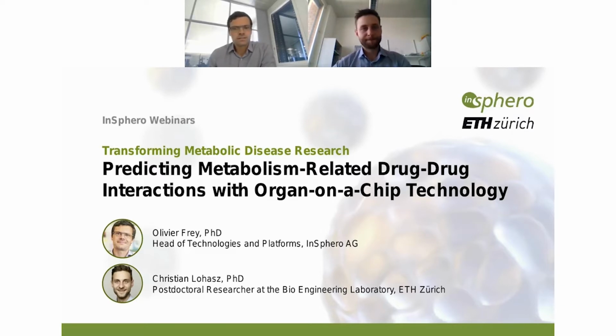So the presentation that we will give is the fruit of one of the collaborative efforts that InSphero had with ETH in the past, where we developed a microfluidic system, which will be the first part of the presentation that I will give. And we use this microfluidic system, Akura flow organ-on-chip technology, for a specific case study looking at drug-drug interaction. And this will be the part of Christian.